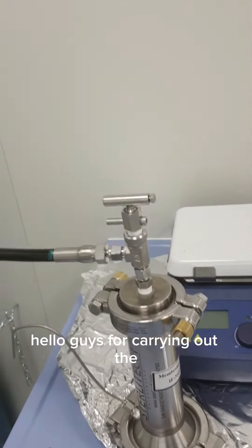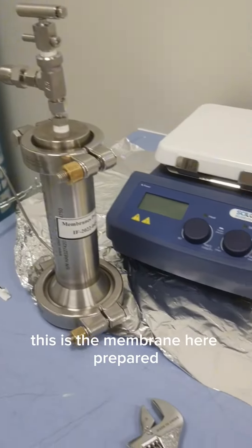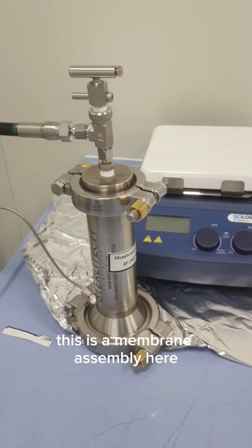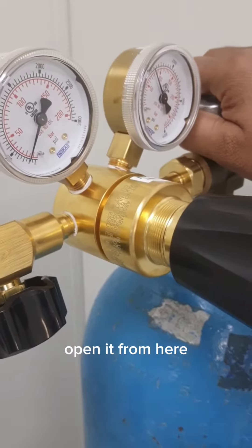Hello guys, for carrying out the analysis or checking the performance of the prepared membrane, this is the membrane here we prepared using this assembly. This is the membrane assembly here, and you can see the pressures. Usually, for carrying out the analysis, first of all we have to open it from here.